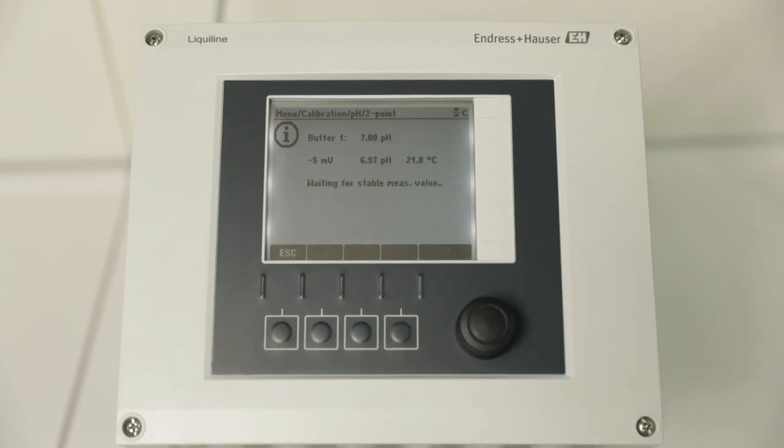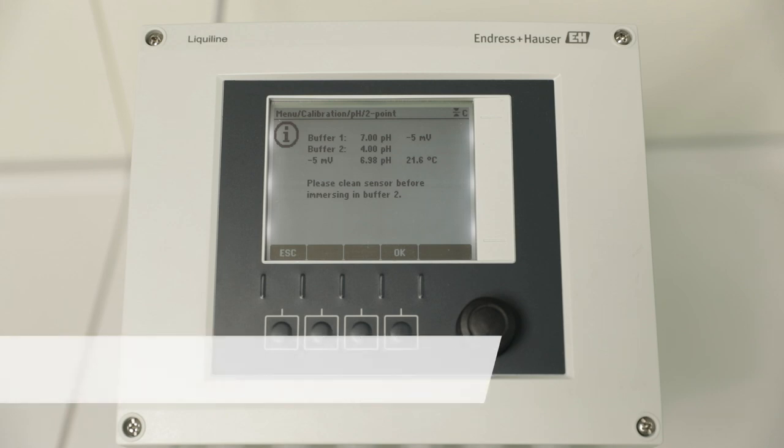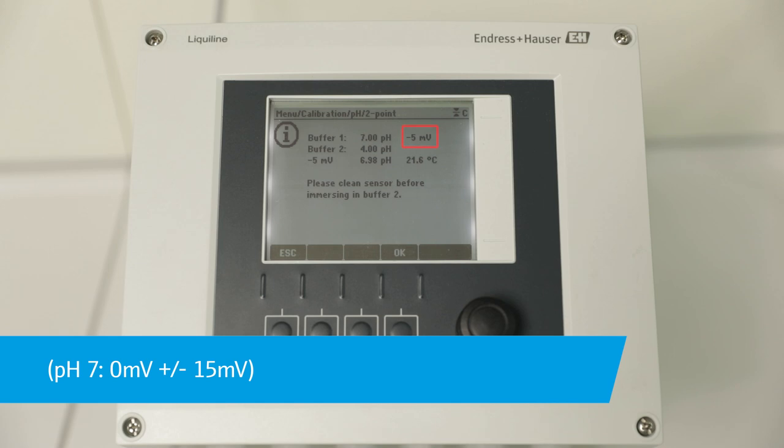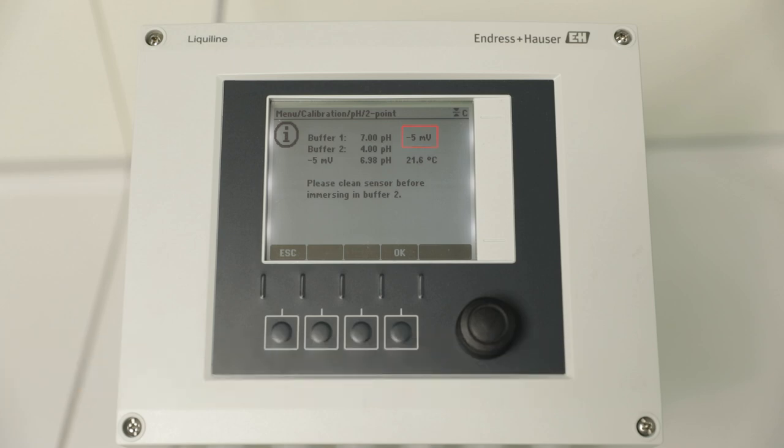The instrument waits now for a stable measurement value. If this is given, the value is taken over automatically. Check the display raw value. For a buffer with pH 7, it should be around 0 mV plus or minus 15 mV for a new pH sensor.